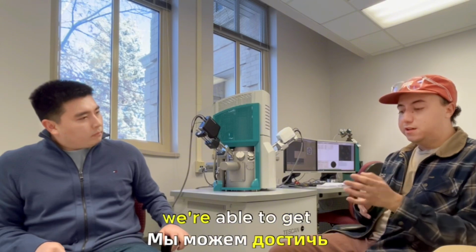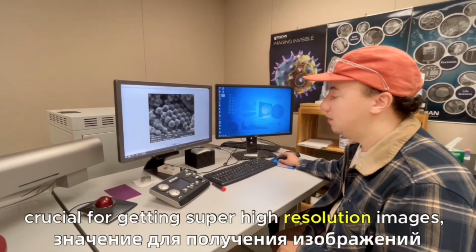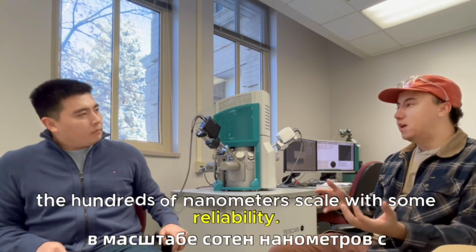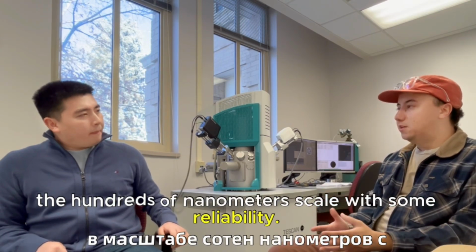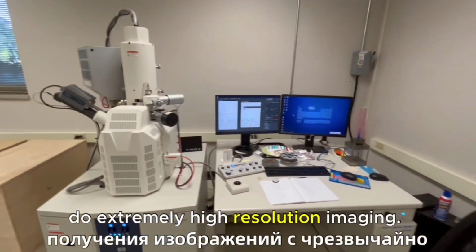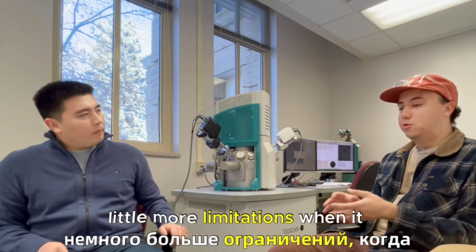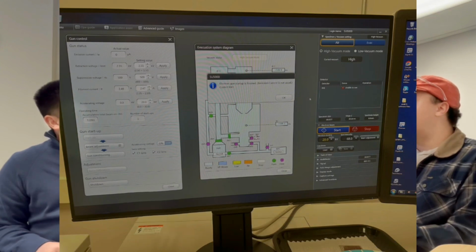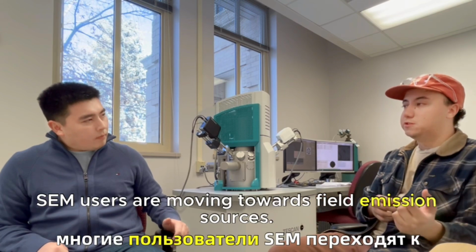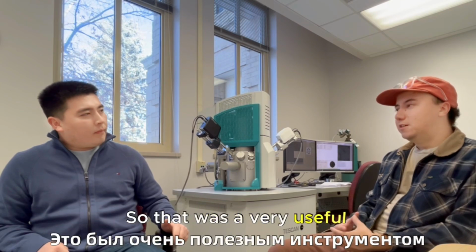So with SEM imaging, we're able to get to a much higher resolution. A field emission source is really crucial for getting super high resolution images, and I can image telluride grains on the hundreds of nanometers scale with some reliability. Whereas this instrument is fantastic for what it does, but it's not designed to do extremely high resolution imaging. It's a tungsten filament SEM, and those typically have more limitations when it comes to resolving power. You'll see that a lot of SEM users are moving towards field emission sources because they're getting more and more popular and more available and for better prices.